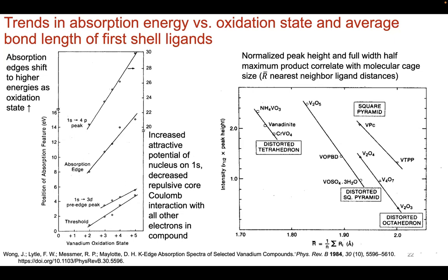But my point is, so that's for the absorption. It's the high energy absorption, the high energy line. But my point is, you see the forbidden transition in the pre-edge because you are seeing basically the 1s to 3d transition, and that's only allowable because it's actually mixing, the 3d orbitals mixing with the 4p.